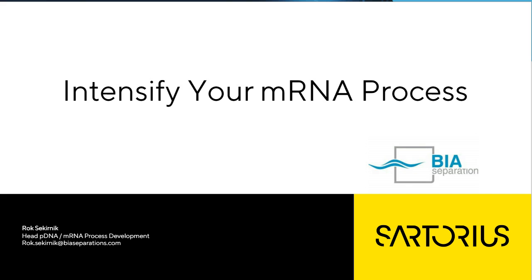Okay, thank you. And how do you compare membrane chromatography and monolith for mRNA purification? Yes, this is, again, a very good question. Within Sartorius, we were implementing the monolith for mRNA purification work. And so we have these oligo-dT monolithic columns, which are designed specifically for purification of messenger RNA.